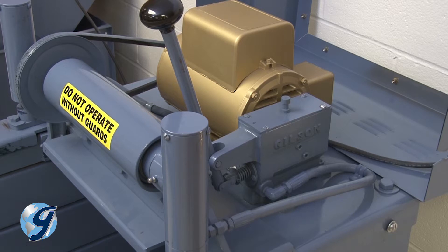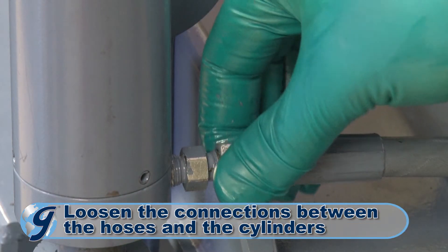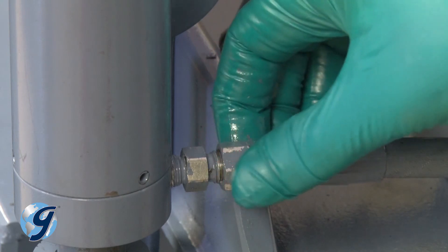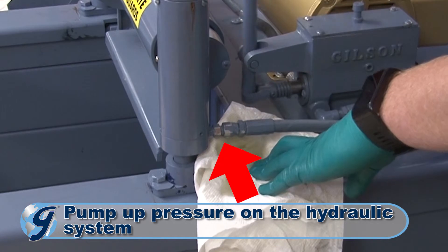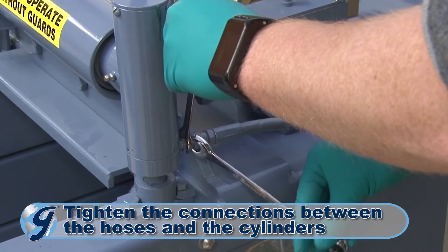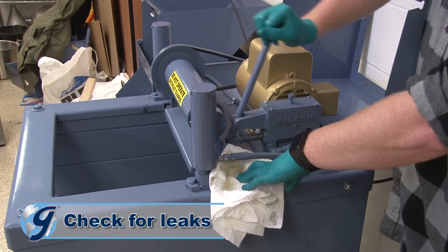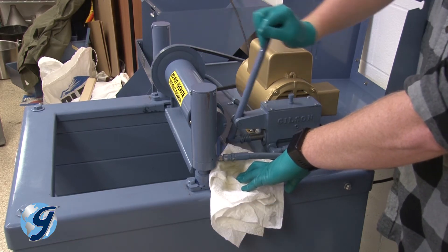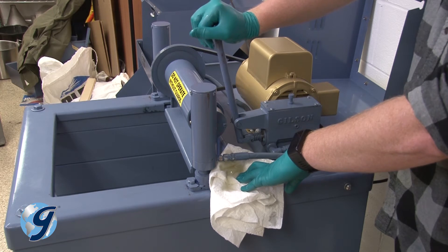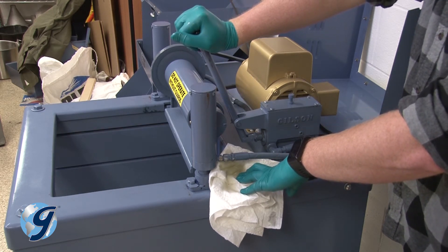Now, we are going to bleed the air out of the hydraulic system. Loosen the connections between the hoses and the cylinders by unscrewing the swivel connections slightly. Pump up the hydraulic system until oil appears at the loosened connections, then retighten the swivel connections. Once tightened, pump the hydraulic system to confirm that all fittings are free of leaks. If the fittings leak, use hydraulic joint compound to create a seal between each leaky fitting and the pump or cylinder to which it is attached.